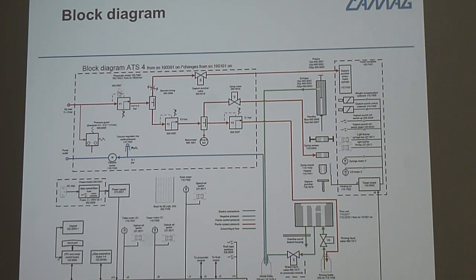Then we have a low pressure. Then we have here a reducing part, called P1. From 5 to 6 bar, we have here a reducing to 3.5 for the old model. For the newer one, 4.5 bar. And then it's splitting. One goes to the septum puncture. And one we have also here reducing, because here we have a special screw, because the movement of the septum puncture is also controlled with the septum puncture valve, and we can change here the speed by changing also the diameter of this tube.